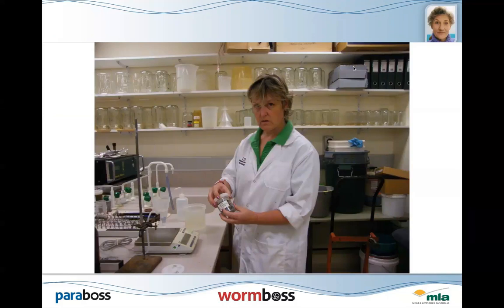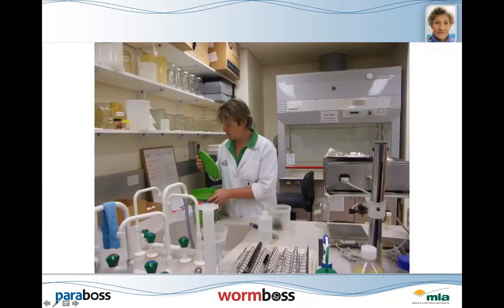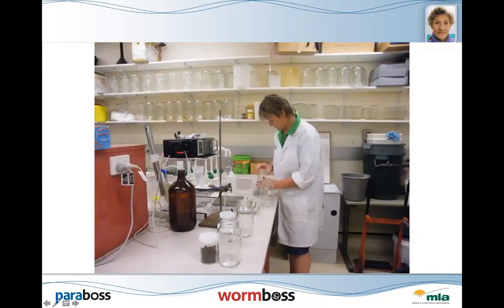Now, this one's Sarah Bowers at the GIST laboratory. She's just showing you how to do a larval culture. Just a quick shot of this. Taking the remaining part of the sample, and then we've got a container here, and just using the remaining stuff after the egg count, get some vermiculite, and then we mix it up.